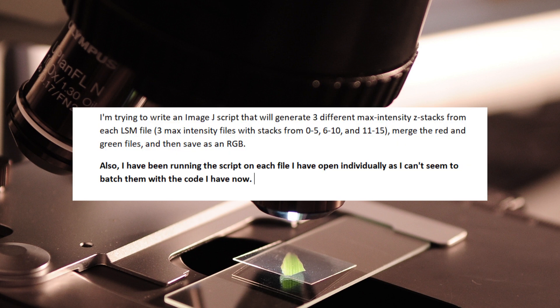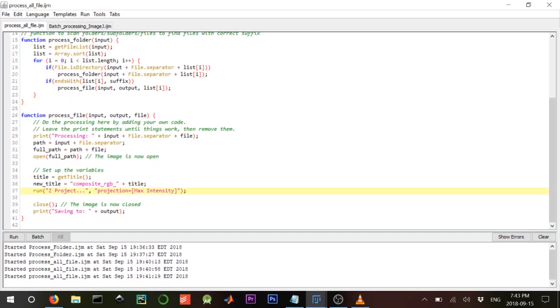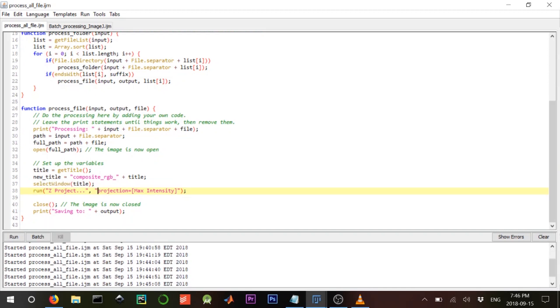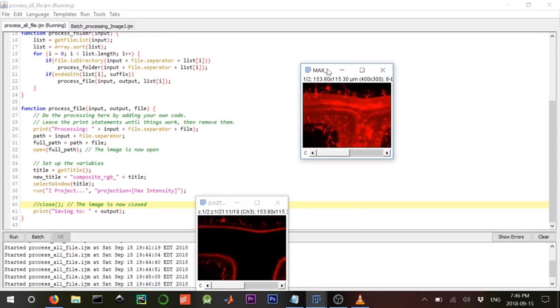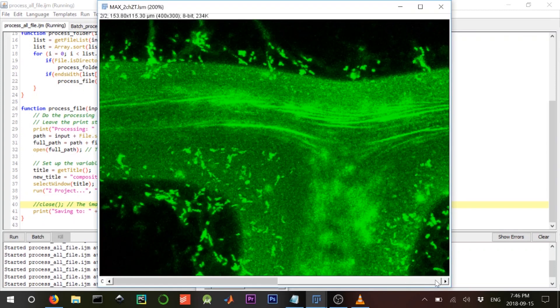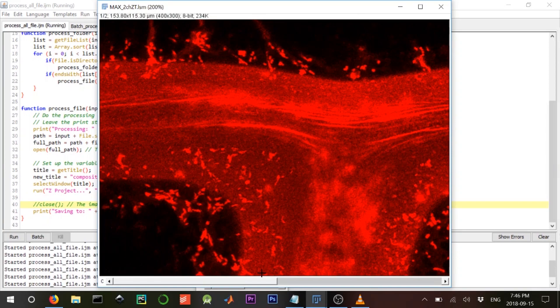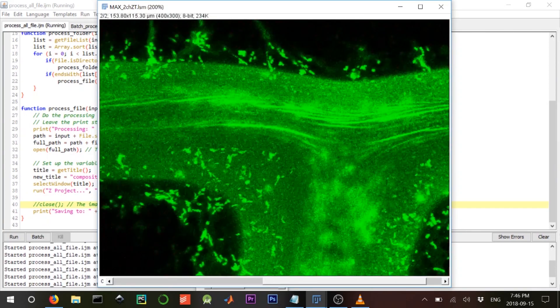In the problem they say generate three different max intensity z-stacks from each file. To make a max intensity z-stack we use run Z Project. These are macro functions you need to know — you can Google them or check the documentation. Let's run and close it to see what happens. There we go — we made our z-stack, concatenating all the slices together with our two channels.